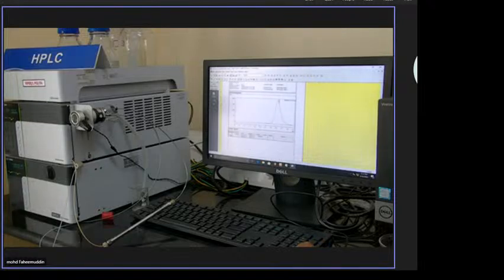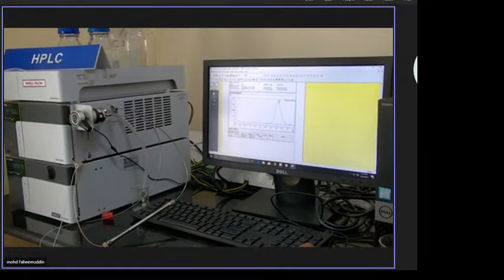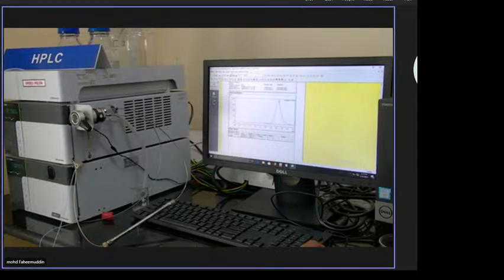If, for example, you got two peaks, one is at 4, 7 lakhs, and the other you will get at around 2. Here, one more column you will get. At 2, maybe it is 20,000, 40,000. They are based upon the area under the curve. Any questions?